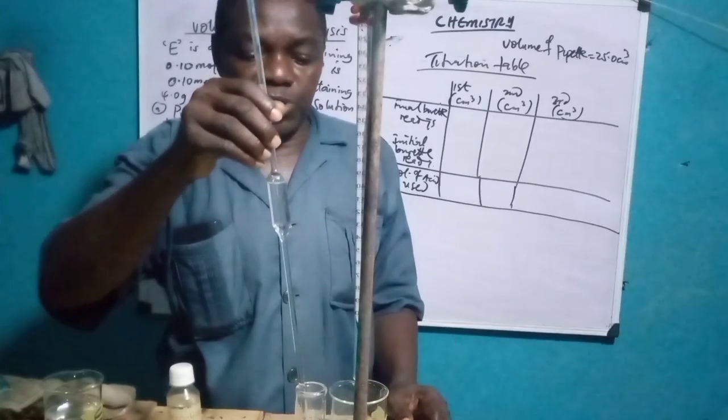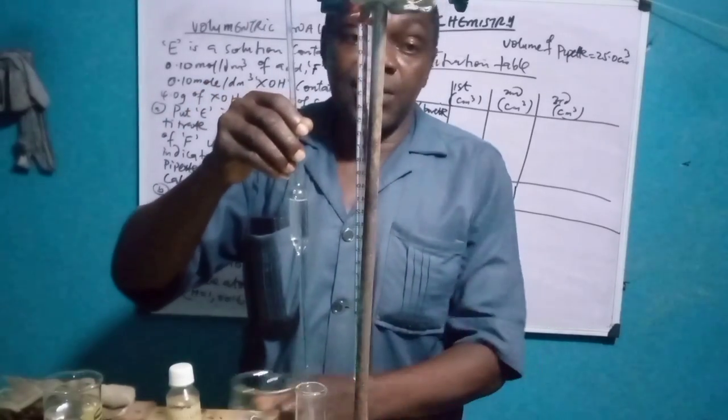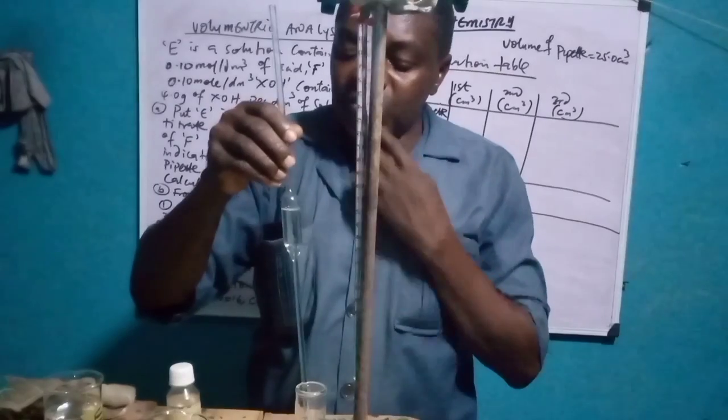Allow it to flow through, to drain through. Remember, 3 is enough. Remove the 3, pick 2 concordant.